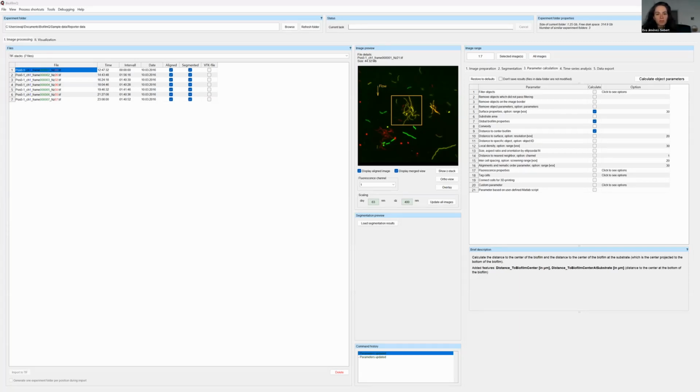The second question is, how can we segment individual bacteria in packed biofilms? Yeah, that is exactly the problem, right? There's a lot of development on imaging techniques to be able to do this. It depends very strongly on how good the signal to noise ratio of your data is. You can try to counteract a bad signal to noise ratio with image analysis, but there is definitely a limit. The most important thing is basically how good is your data.